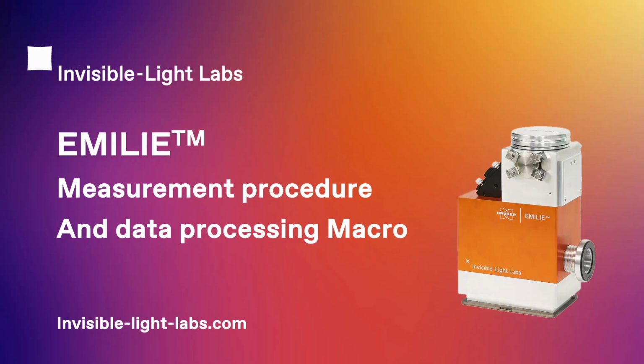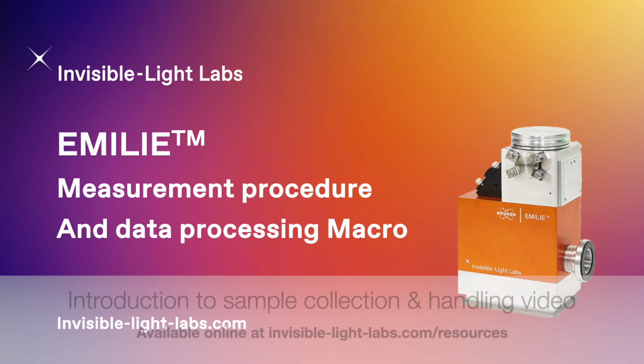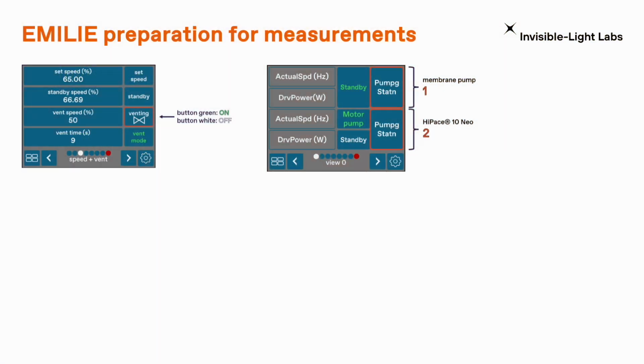Welcome! In this video we will guide you through the measurement and data processing workflow for EMILIE, our groundbreaking nanomechanical analyzer. If you're unfamiliar with sample preparation or general chip handling, we recommend watching our Introduction to Sample Collection and Handling video first.